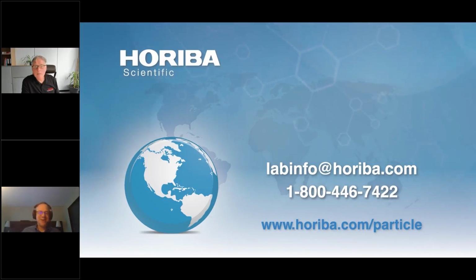Yeah. Boy, you just know I'm going to take this one. Okay, so let's talk about adjuvants for a moment. Most adjuvants I've encountered run down into the hundreds of nanometers in particle size, and so image analysis is not really an applicable technique. There are a few that are a fistful of microns that I've encountered, but nothing large enough for something like this.